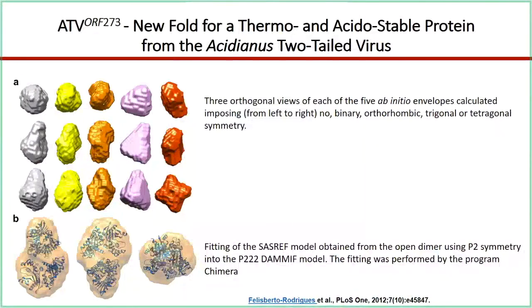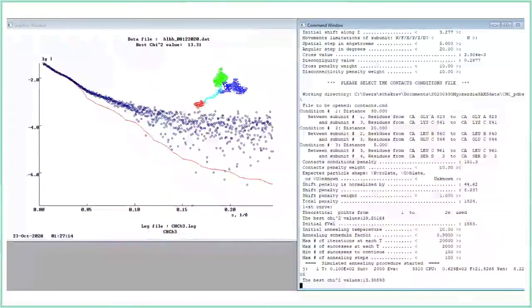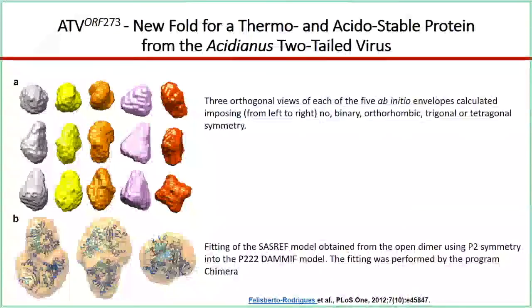So, for example, in this case, this 380 kilodalton protein that I'm working on, there is obviously no symmetry there, given our initial hypotheses. The initial conformations were pretty asymmetric, so I know there is no symmetry there. But with oligomers, there is a high likelihood that there is symmetry. Oligomerization, again, is not a prerequisite for there to be symmetry, but it is the most obvious case.